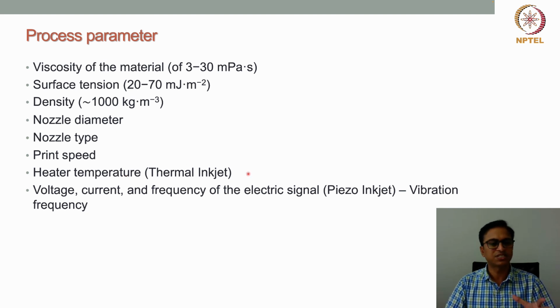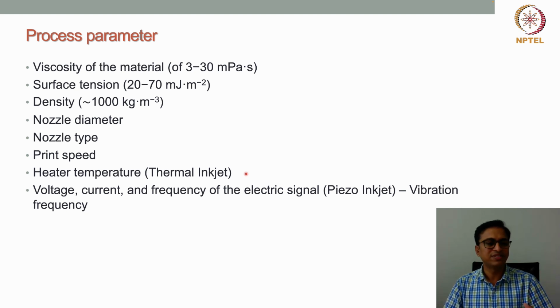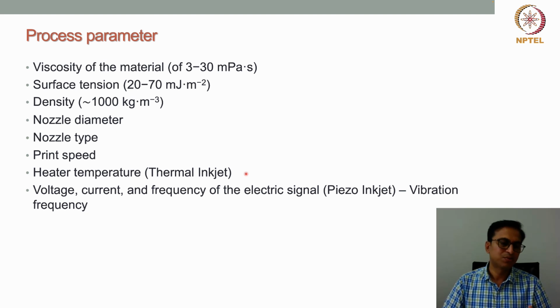So the heater temperature can be controlled and kept at a certain level, so that it is not detrimental for the encapsulated or suspended particles, suspended cells or biomolecules, but it should be enough for efficient droplet production.